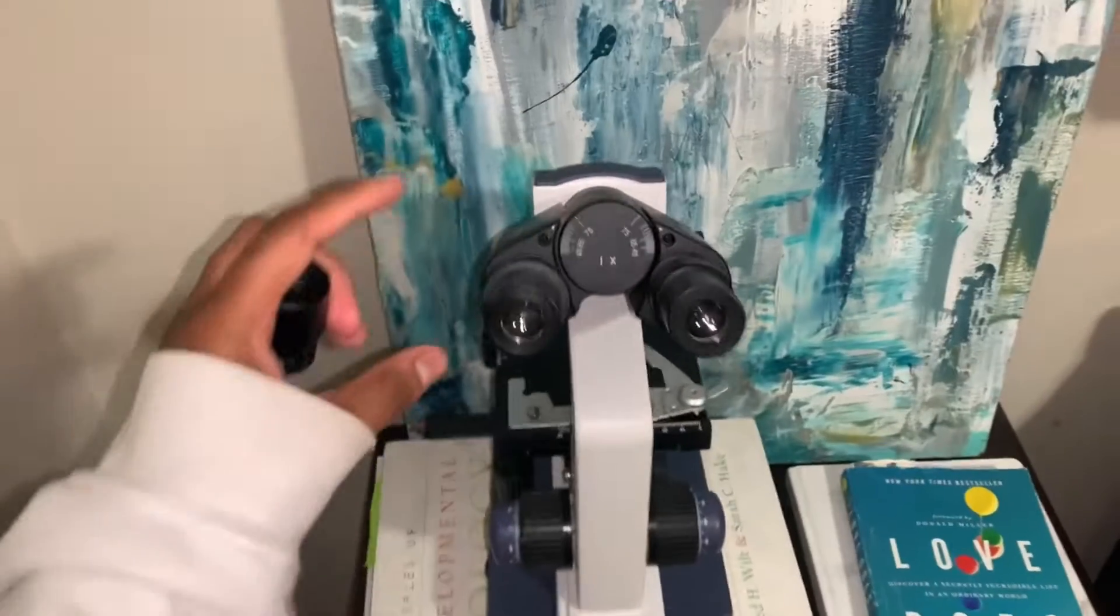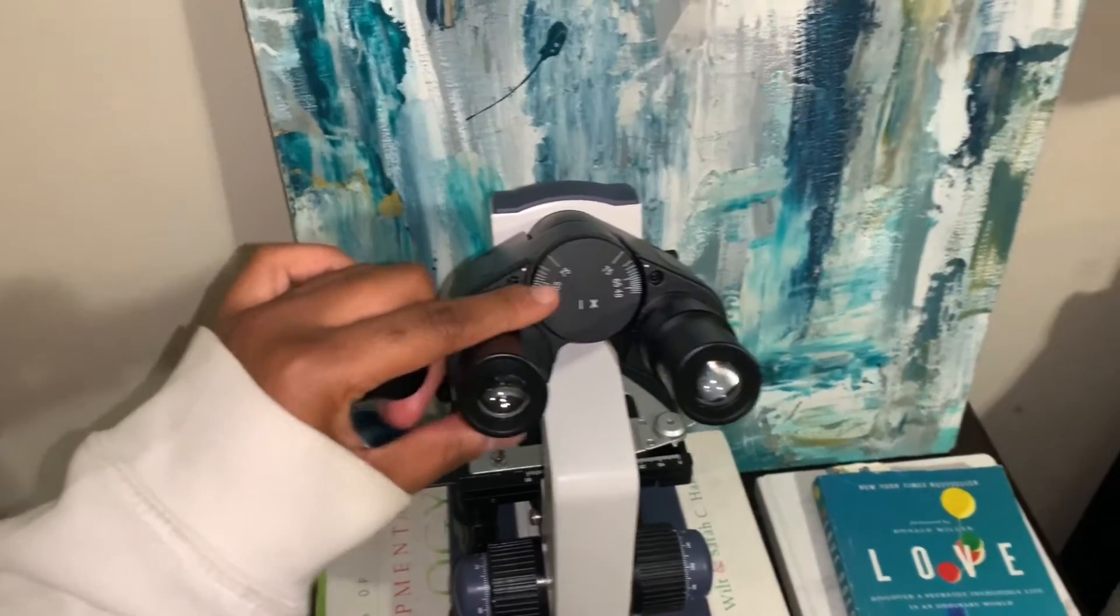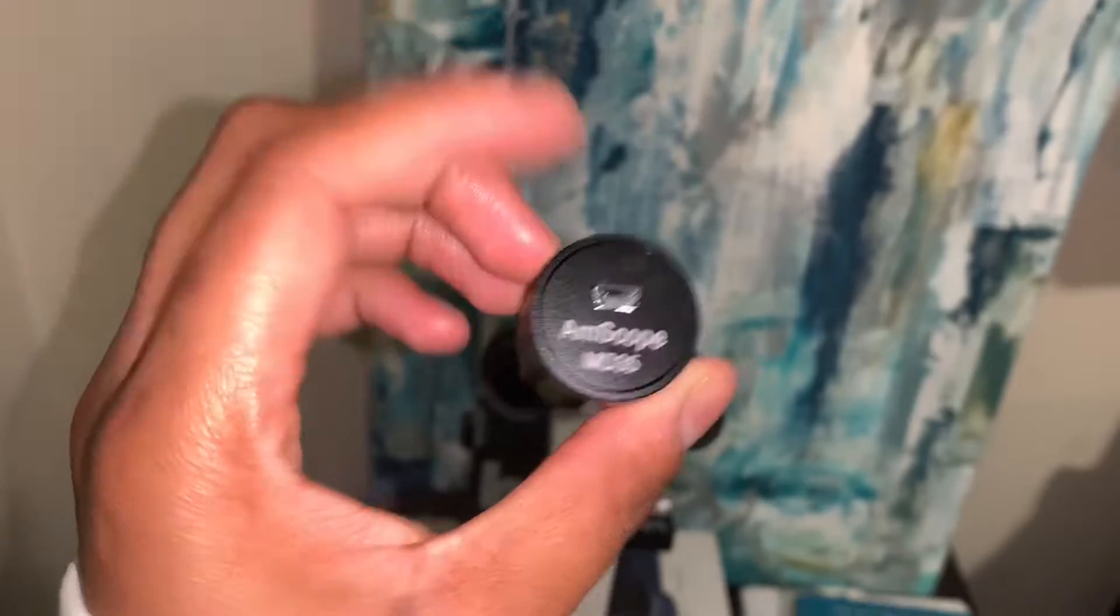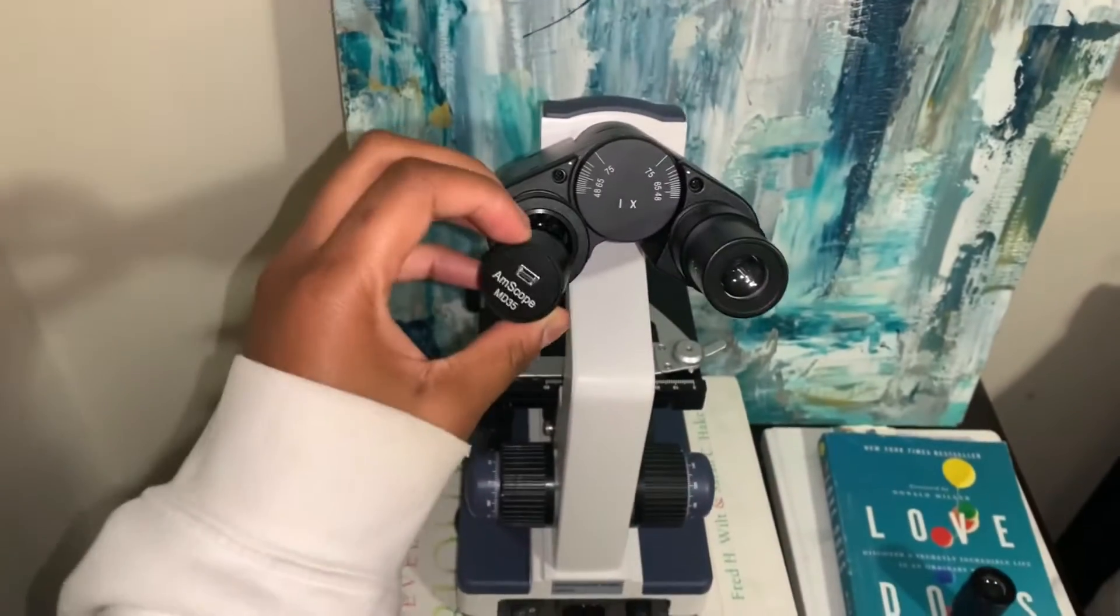So right now what I'm going to do, I'm just going to show y'all all the pieces. So I just took one of the lenses out and I'm replacing it with the camera.